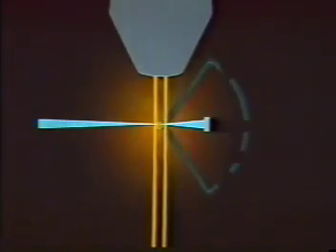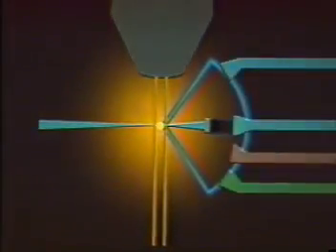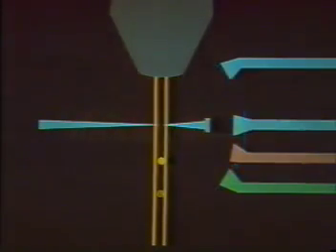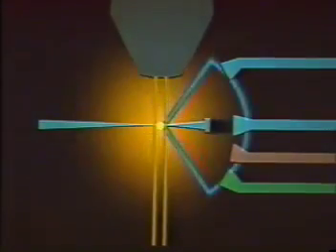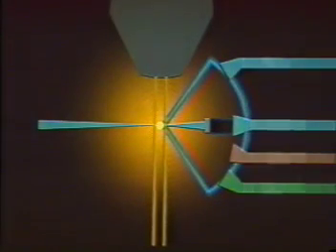The amounts of scatter and fluorescence generated by each cell are measured by light sensors that surround the cell's stream. On the FACS 440 that Keith is using, there are 4 such detectors. 2 are currently adjusted to respond to red and green fluorescence. The other 2 are positioned to measure the amounts of forward scatter and large or obtuse angle scatter. Each time a cell passes into the laser beam, these sensors convert the amount of scattered or fluorescent light they detect into correspondingly large or small electrical signals.